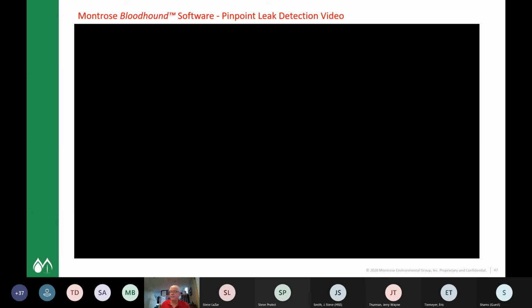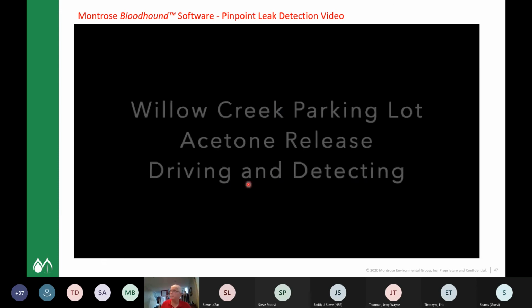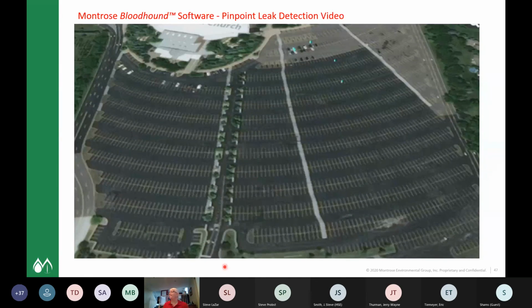it's kind of hard. When you see an aerial view of a lot of places, you can tell what facility it is. So to avoid that, we did a demo in an actual large space. So this is a graphic representation of what our software does. So we created a source of emissions of acetone, and then we put it out, and we took the PTR, and we're going to find this.